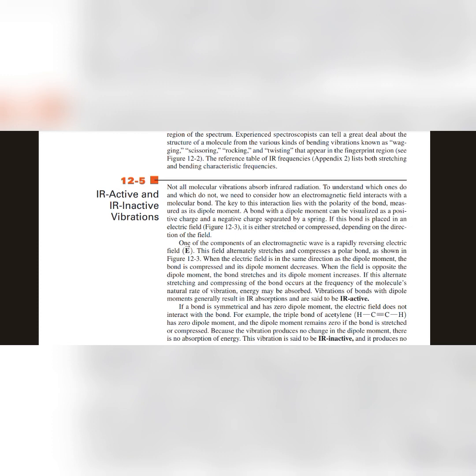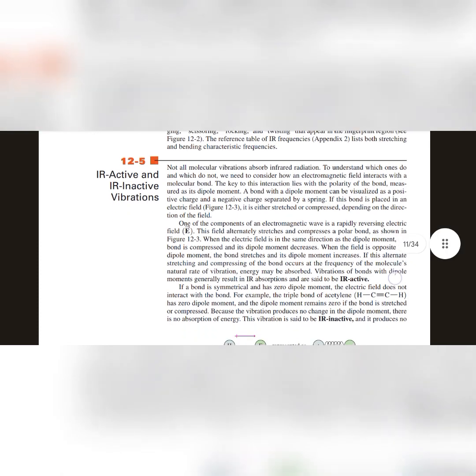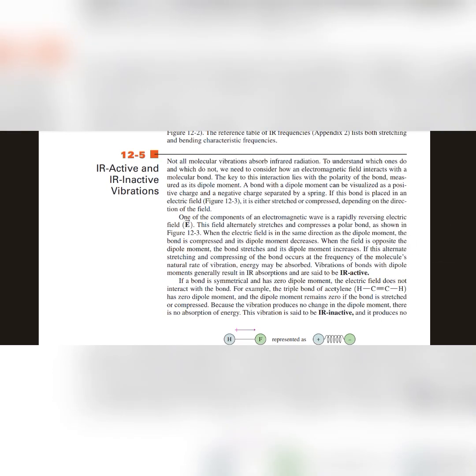IR active and IR inactive vibrations. Not all molecular vibrations absorb infrared radiation. To understand which ones do and which do not, we need to consider how an electromagnetic field interacts with a molecular bond. The key to the interaction lies with the polarity of the bond, measured as its dipole moment.